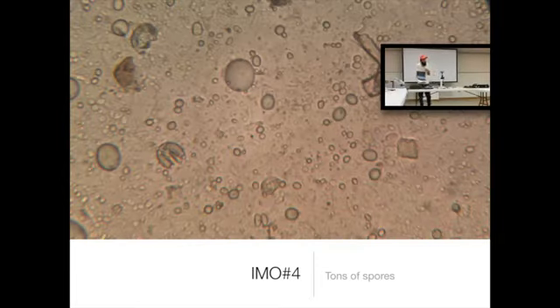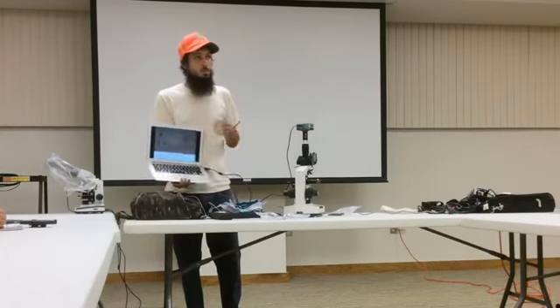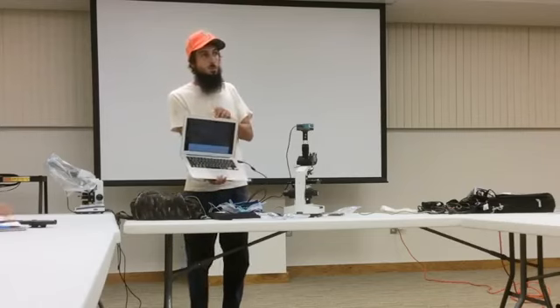And this is just what IMO4 looks like. When you put IMO4, the sugar and the osmotic pressure make the organisms form globs and spores, and there's not much active stuff happening in the actual input. So if you just take the inputs and look at them, they're not that exciting. They kind of look like this. But once you dilute them and get them wet and make the sugar not so powerful, then this will sprout into life. Every once in a while you will find some fungus living in the IMO itself.